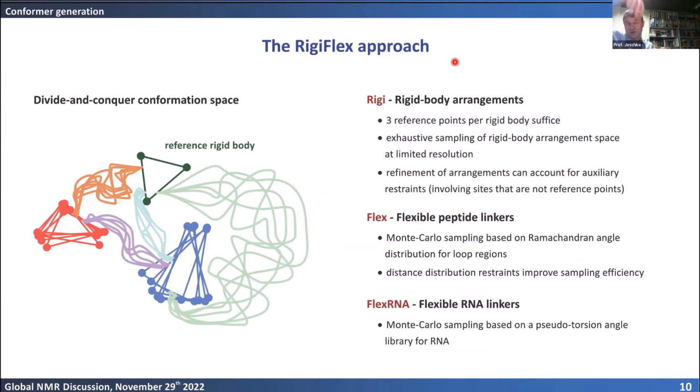If you think about the conformation of a peptide chain, then you have different Ramachandran angles, and each of them can have different realizations. Let's say you have 370 pairs of Ramachandran angles, each of them has 3 possible values. Then you get a number of conformers that you could never generate in a computer. So you have to have some way to simplify the problem to get the representative result.